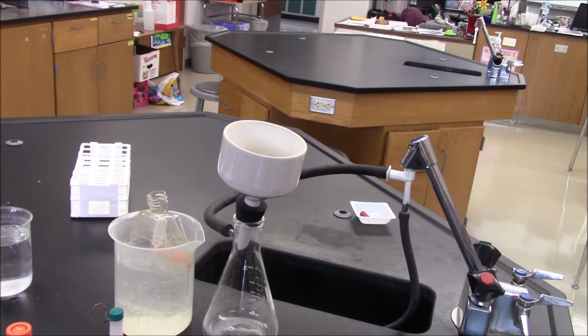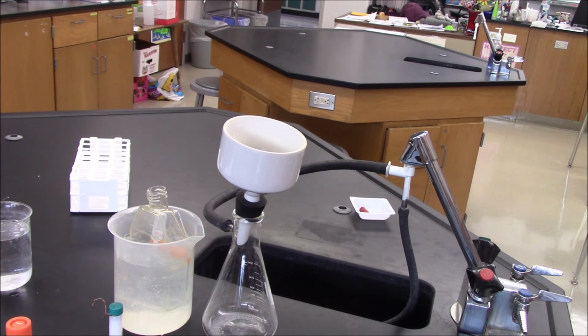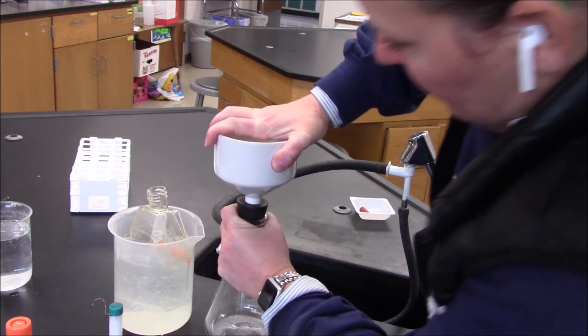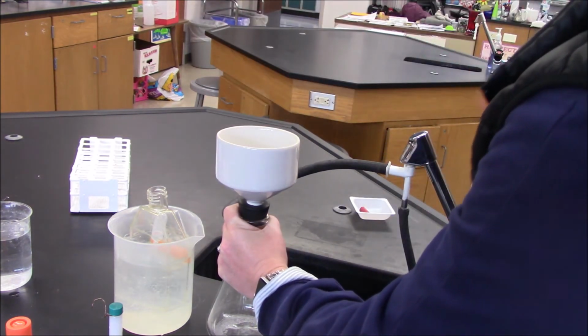Okay. Let's see, I have a pipetter, but like I said, I think this is going to be a bit of a hardship. So here we go. I've got to really get this in there. Okay.